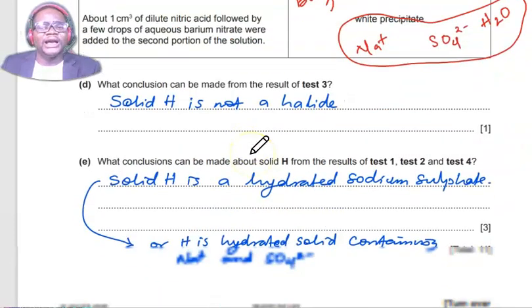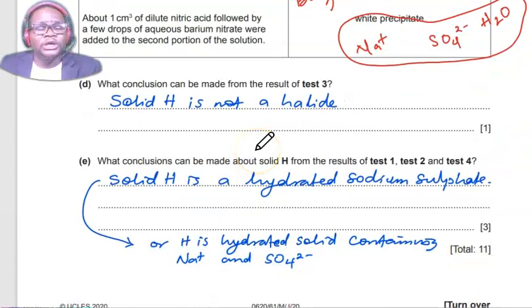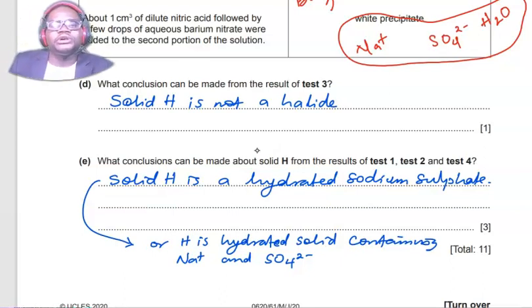Solid H may be a hydrated solid. So let's answer the question. What conclusion can be made from the result of the test? Solid H is not a halide. Of course, yes, it's not a halide.